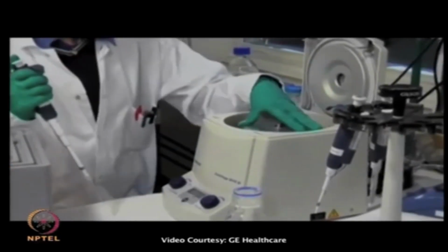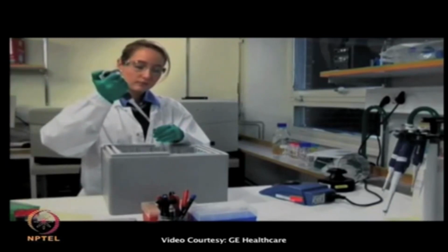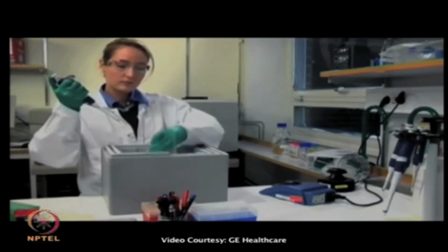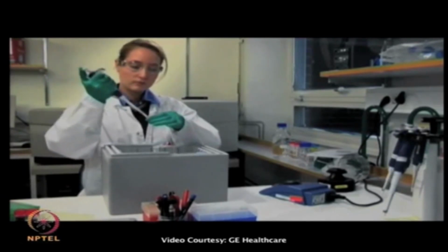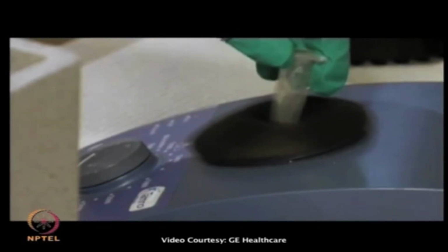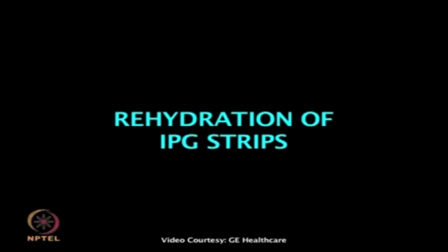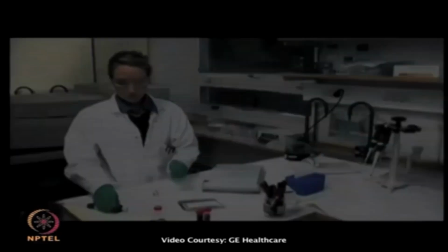The proteins on the cell surface are now labeled and the cells are washed and ready to be lysed. The pellet from the last washing step is resuspended in 150 microliters cold lysis buffer containing 7 molar urea, 2 molar thiourea, 4% CHAPS, 30 millimolar Tris, 5 millimolar magnesium acetate pH 8.5 and left on ice for at least 1 hour with occasional vortexing. The samples are now ready for 2D gel separation.